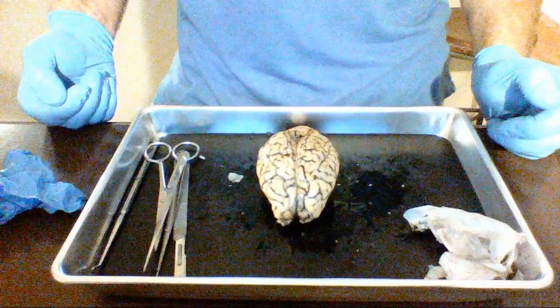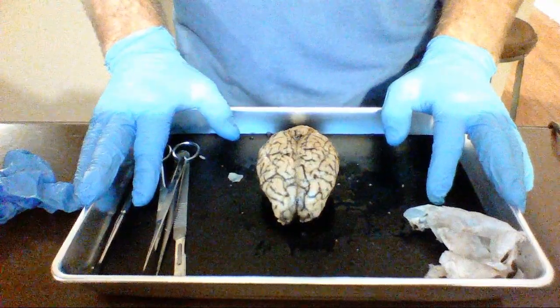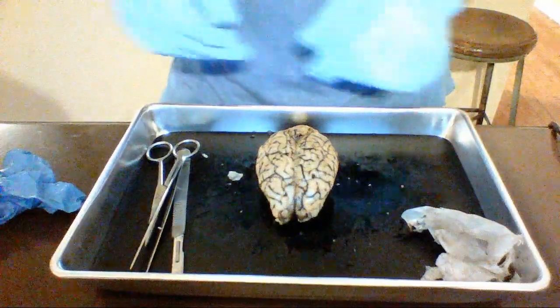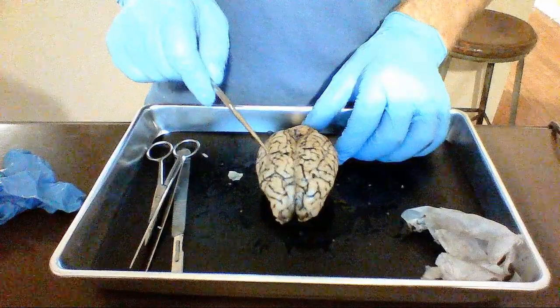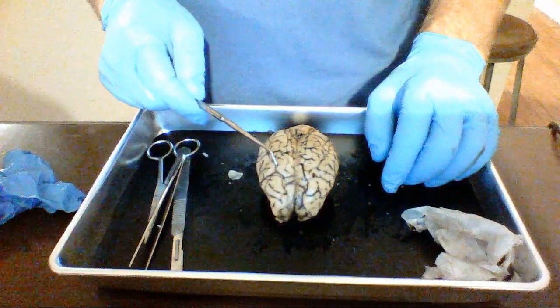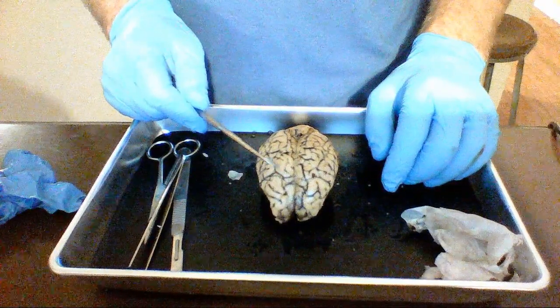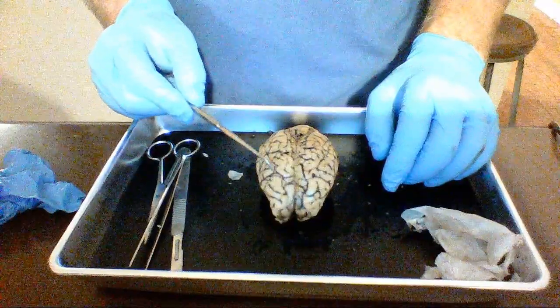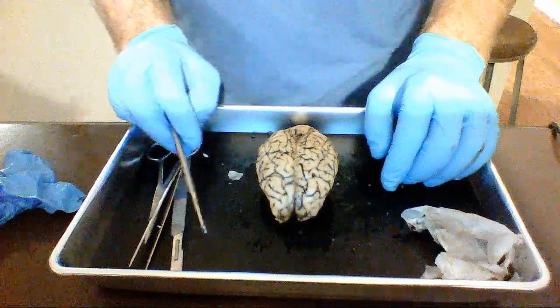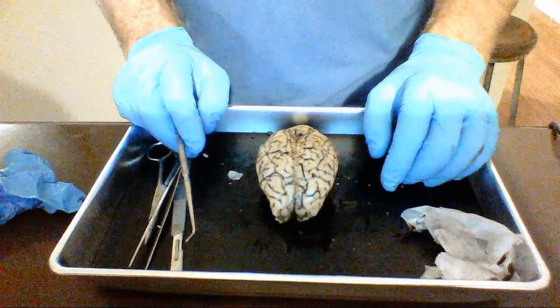Okay, we've finished removing the meninges, and now we're going to look at the external structures that we can see here. So we've got the superior view right now, and you can see the two cerebral hemispheres, the left and the right. And on those you have some bumps and grooves. The bumps, the ridges, are gyri or gyrus, singular, and the grooves are sulci or sulcus. This ridging is wonderful because it means we have more surface area where we're going to have neuron cell bodies.